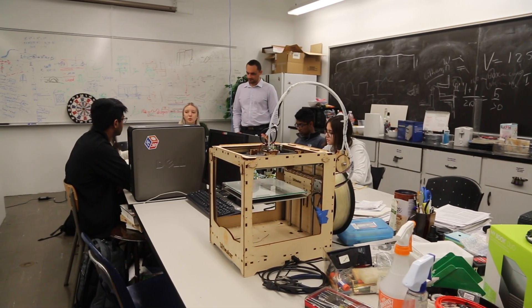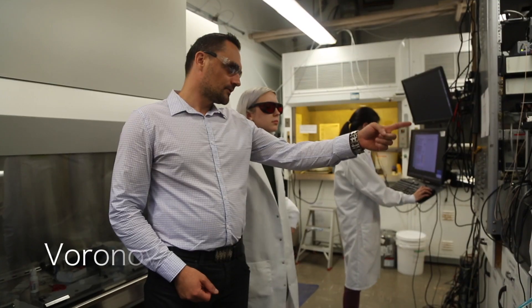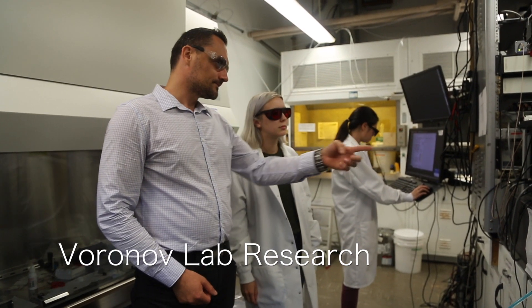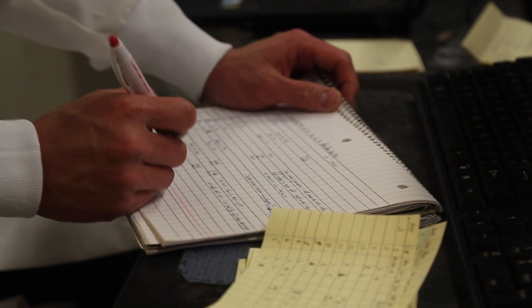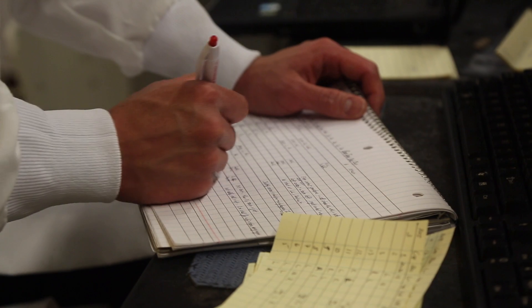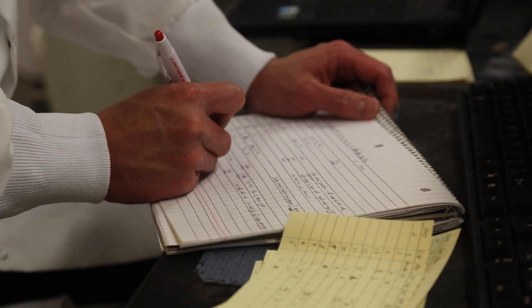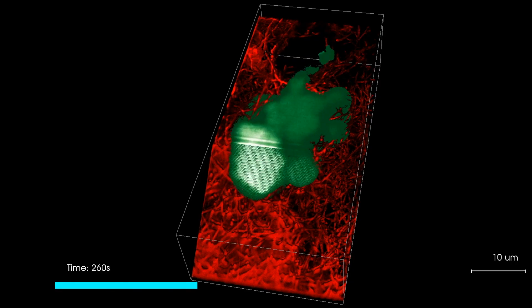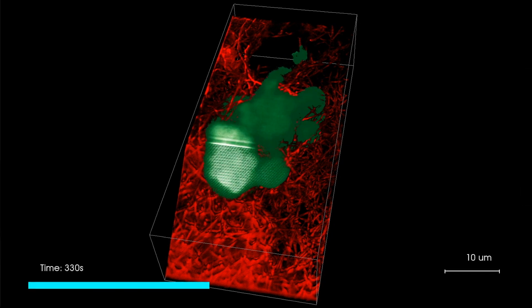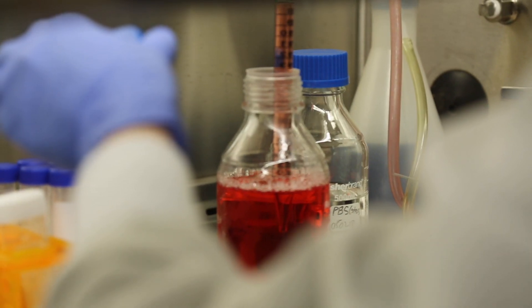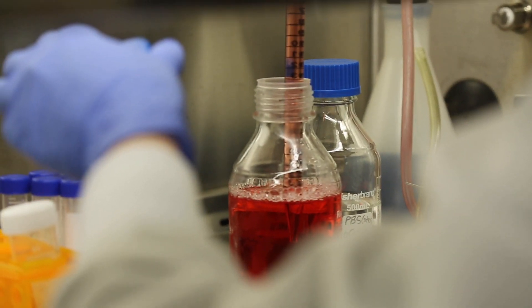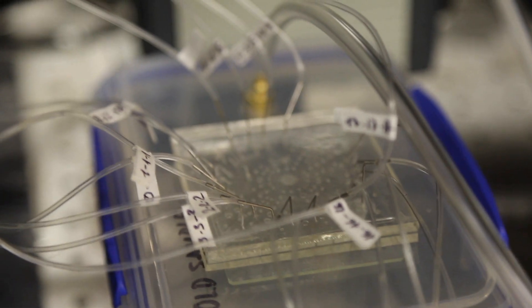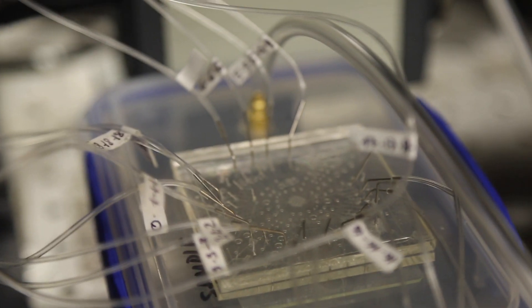Here at the V-Lab we have two main directions. One is tissue engineering, so we have devices which allow computers to control how cells build artificial tissue, and this is useful for growing artificial organs to replace kidneys, hearts, liver, any type of complex 3D organs.